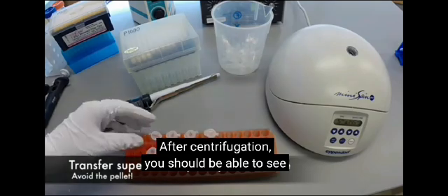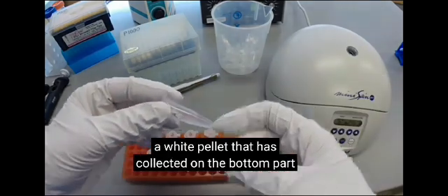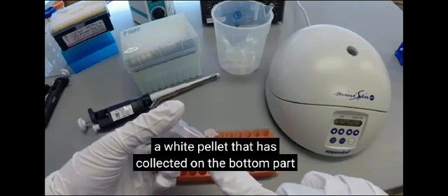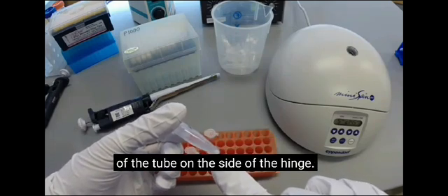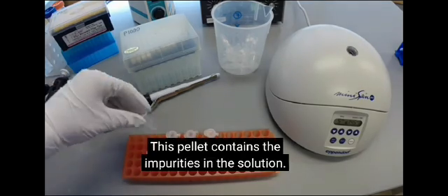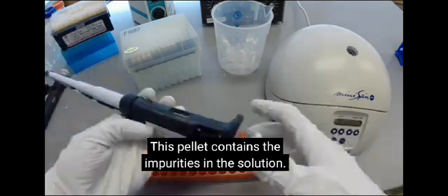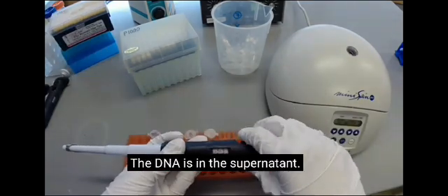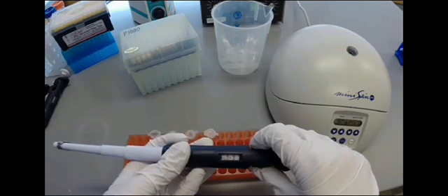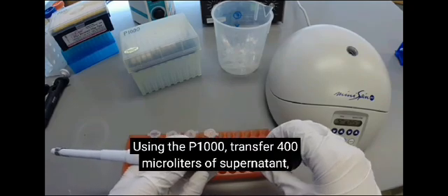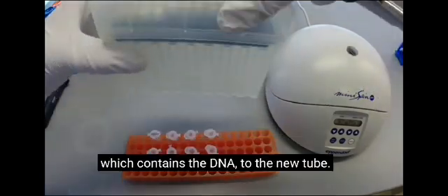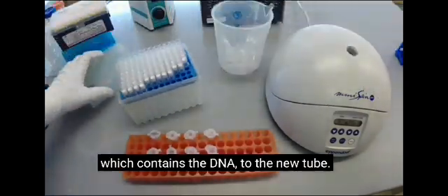After centrifugation, you should be able to see a white pellet that has collected on the bottom part of the tube on the side of the hinge. This pellet contains the impurities in the solution. The DNA is in the supernatant. Using the P1000, transfer 400 microliters of supernatant, which contains the DNA, to the new tube.